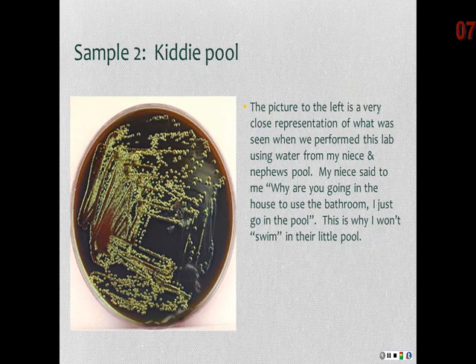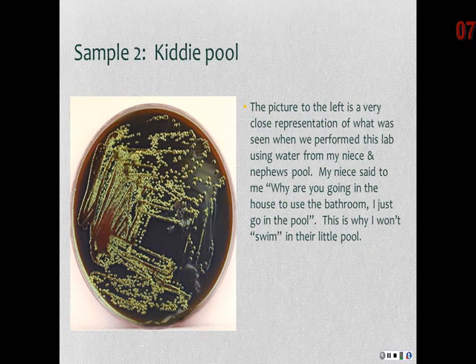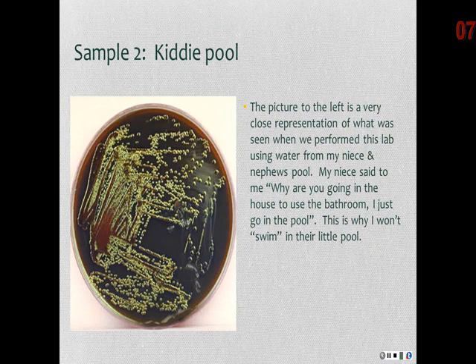For your sample 2, this is going to be from a kiddie pool. This picture to the left is a really close representation to actually what we saw when I performed this lab with water from my niece and nephew's pool.